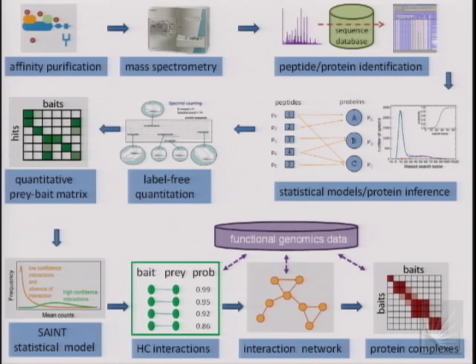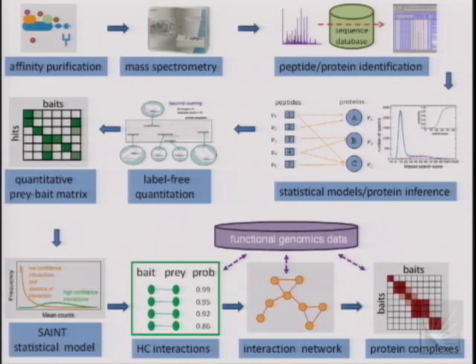And I'll put it here, at all these steps down there, there is functional genomics data that can be utilized as a way to assist in the process, or at least to annotate some of those complexes. For everything that I'm going to be talking about today, we're not going to be using functional genomics data at all, because the goal of this part, up to here, is to get our confidence in protein-protein interaction networks and complexes based on mass spectrometry data. The moment we start coupling existing literature or functional genomics data as a way to reinterpret the experiment-specific data, things get a little bit complicated. So I think it's good to divide things into steps and say, first, we're not going to use any existing knowledge and try to get to this part, and then later one can integrate these different data types rather than utilize functional genomics data early on in the process, although we are exploring different ways of doing that.